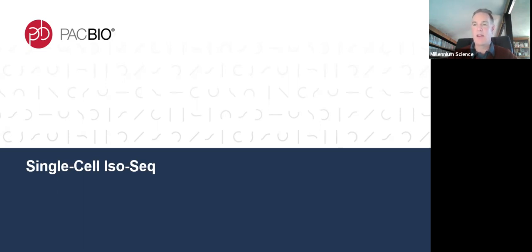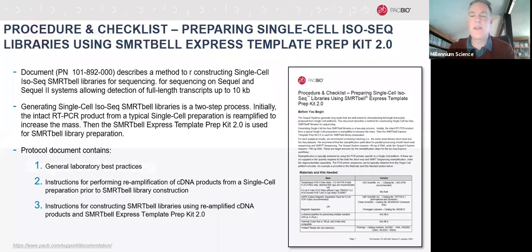So rather than capturing whole transcriptome data, they're capturing specifically the transcriptome from a single cell, and there's a protocol for this because there are a number of single cell companies out there, such as 10x Genomics and others, that are capturing transcriptome information from single cells, from either dissociated tissues or from cell lines and all sorts of things, and they rely on a short read sequencing technology generally, and so they make full-length cDNA as part of their protocol, but then they fragment that down and only sequence a short part of it.